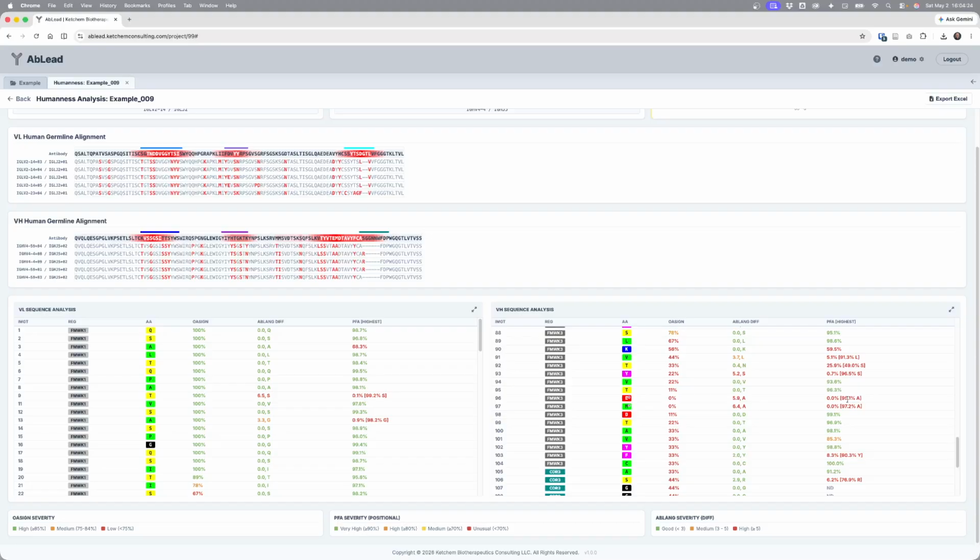What this means in positional frequency analysis is an overview of millions of sequences from human response, showing the frequency of an amino acid at that structure-based position. In this case, the highest scoring positional frequency analysis for both positions is alanine.